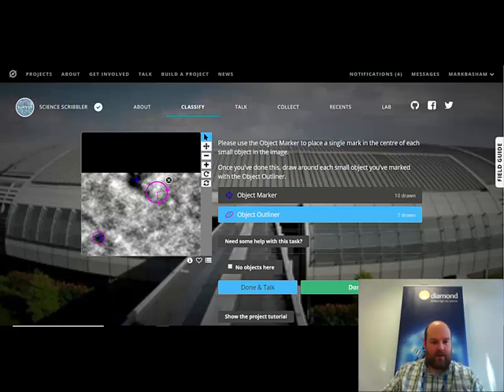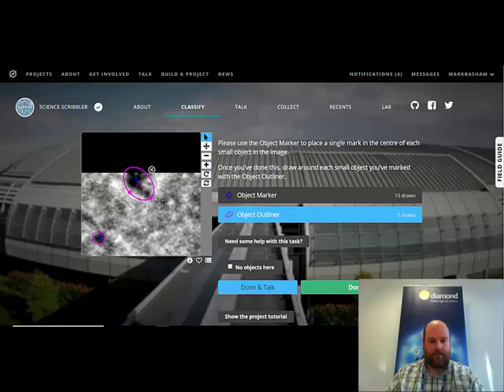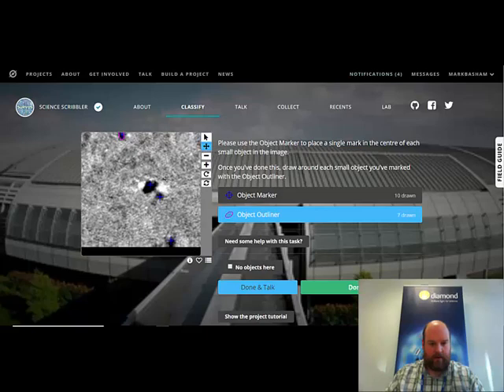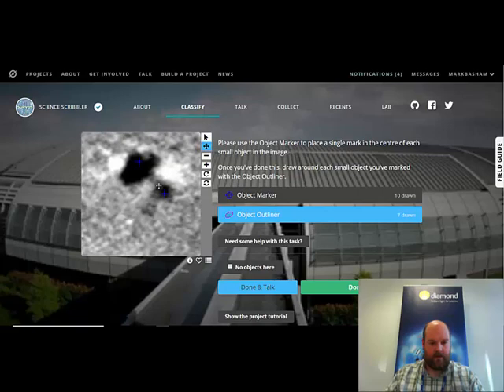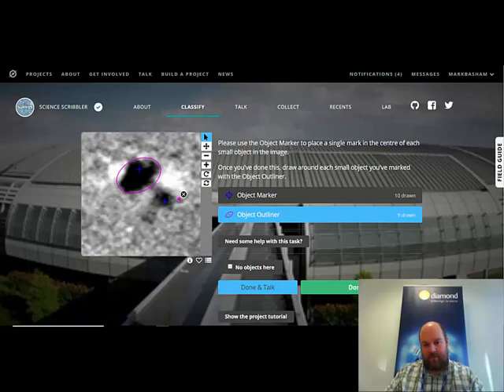Now, this object, you can see with these object outliners, I've just got an oval. Some of the objects that you may see are a bit bigger or a bit strange shape. So just generally try and encompass them with the oval shape. These are things we're going to kind of have to come back to at a later date to analyze. But if you give us a rough idea of where they are using this, then that will help us out lots. I'm not quite... Where are they? Oh, there we go. Here's the other three down here. So let's zoom in again. And then let's put the outline on these objects. That one's about there. Try and be reasonably close to the object if you can, or reasonably close to the object size.